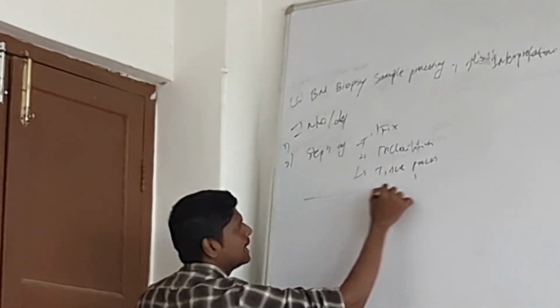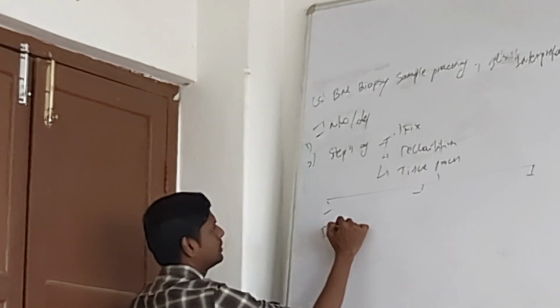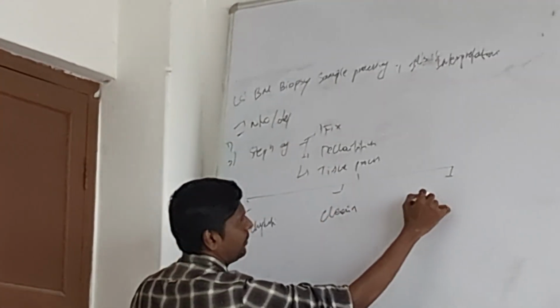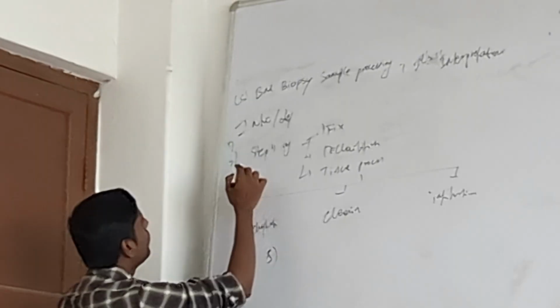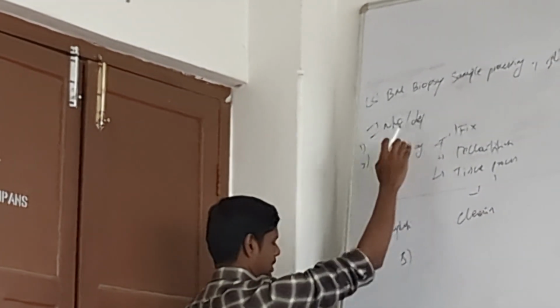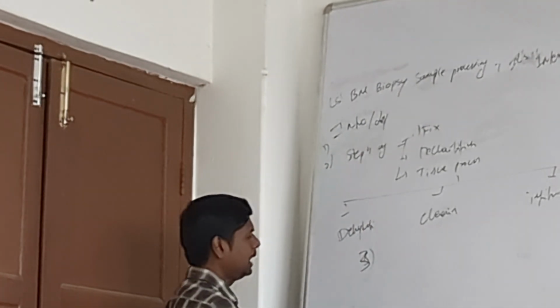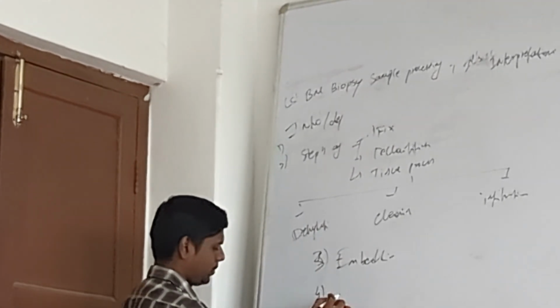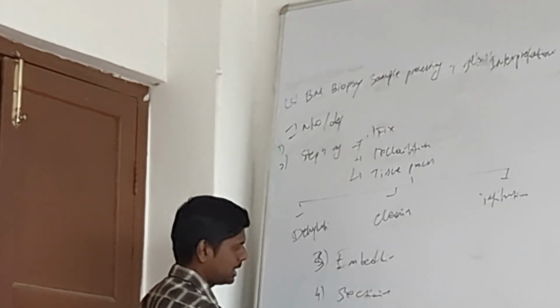In tissue processing, I will focus on dehydration, clearing, and infiltration. Then 3, embedding, 4, sectioning, 5, staining.